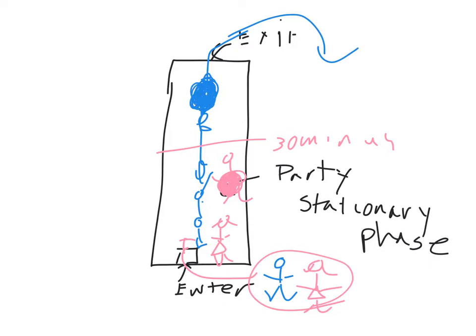And we're going to see compounds doing that as well. Compounds that have a high attraction for your filter paper are going to travel very slowly. Things that have a high attraction for your mobile phase, your water, are going to travel a much greater distance. We can use this to separate components of a mixture.